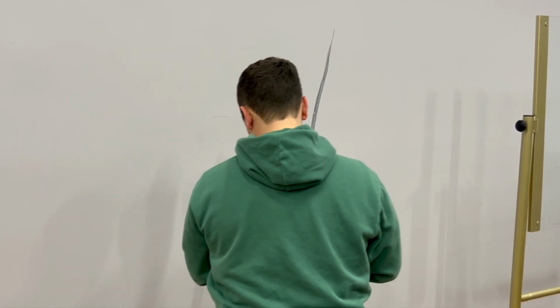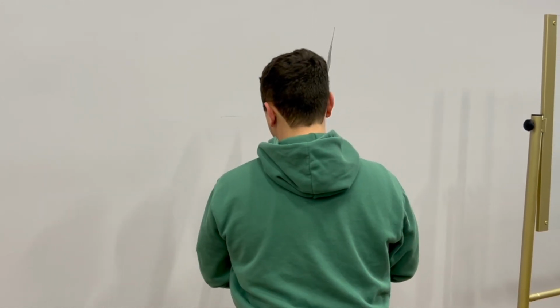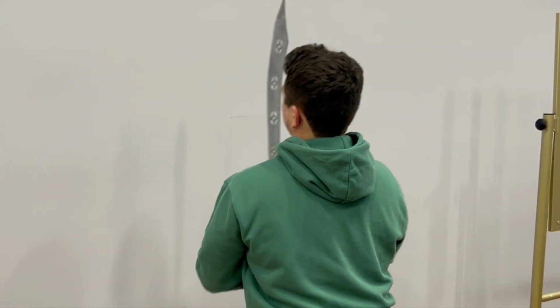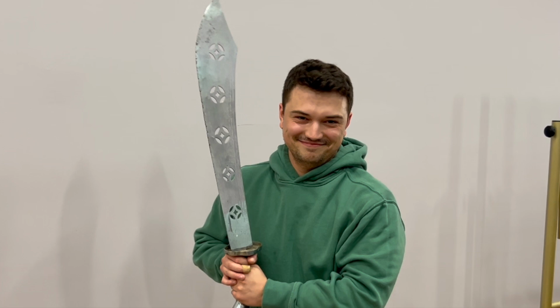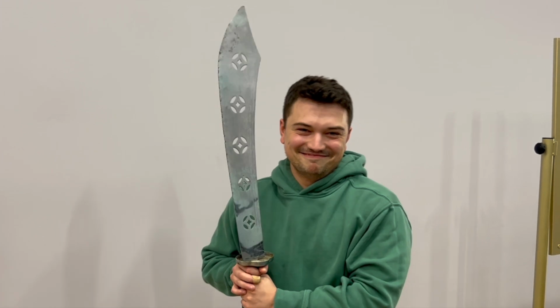A common way to accomplish this is to use an enzyme. In our example, we will use an enzyme called trypsin. Please note the large sword. This is for cleaving the protein into smaller pieces. But don't worry, this isn't the tragic part.